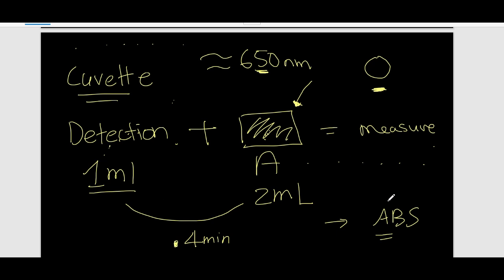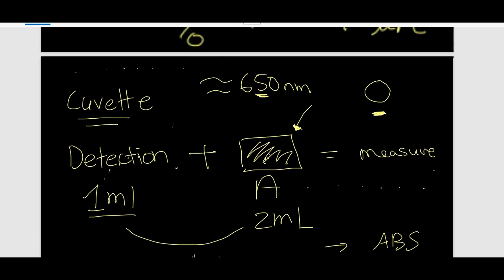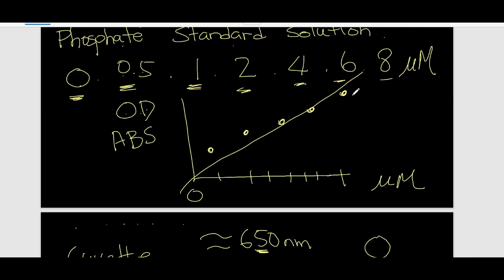Then we measure, and we can find out how much phosphate is inside the solution. So we will get data like this.